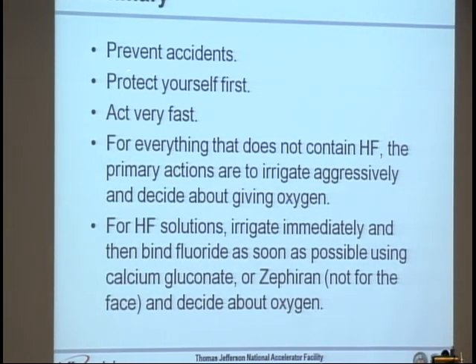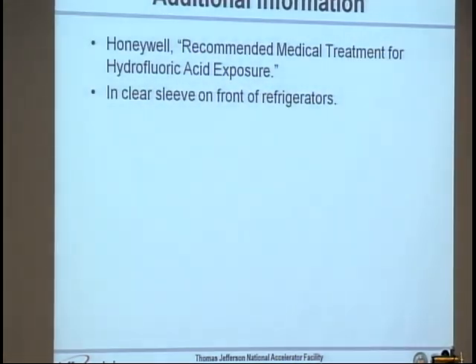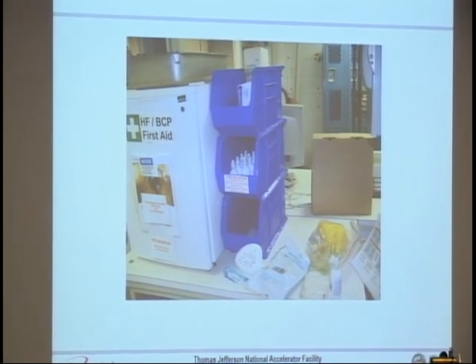In summary: think about prevention first. Always protect yourself and assure scene safety — be very fast. For everything without HF, the primary actions are to irrigate aggressively and make a decision about oxygen. If it contains HF, irrigate immediately then start binding fluoride using calcium gluconate or Zephyrin, but not for the face. It's actually not as complicated as it feels — it's pretty simple. Familiarize yourself with your first aid supplies, including calcium gluconate, eye irrigation, and IV fluid for irrigation. Periodically read your quick references.